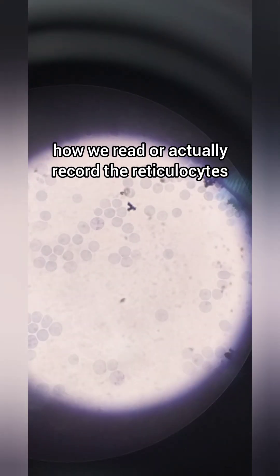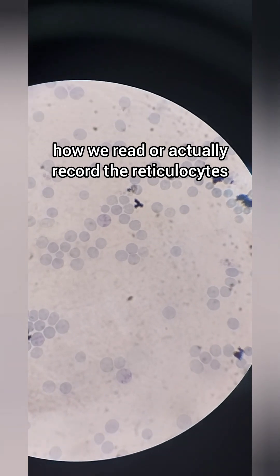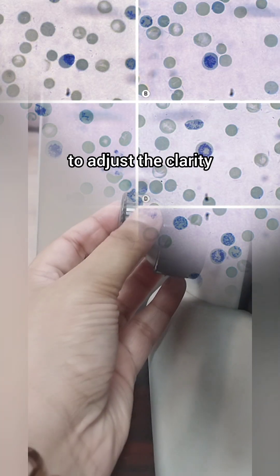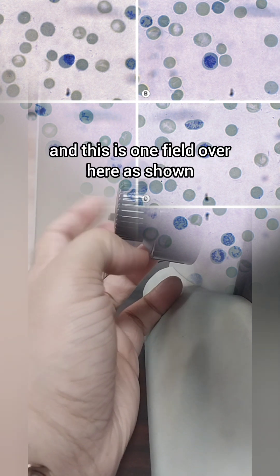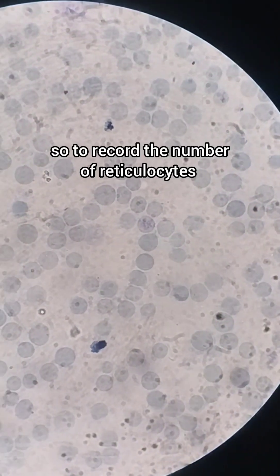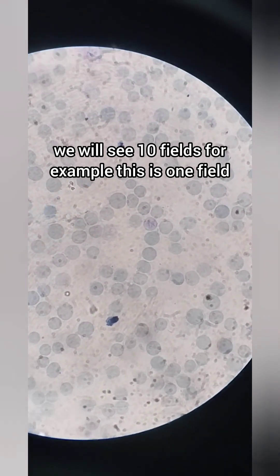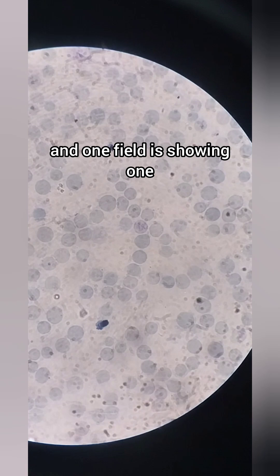Now I'm going to show you how we read or actually record the reticulocytes. You might need to adjust the fine focus to adjust the clarity. This is one field over here as shown. To record the number of reticulocytes, we will see 10 fields. For example, this is one field.